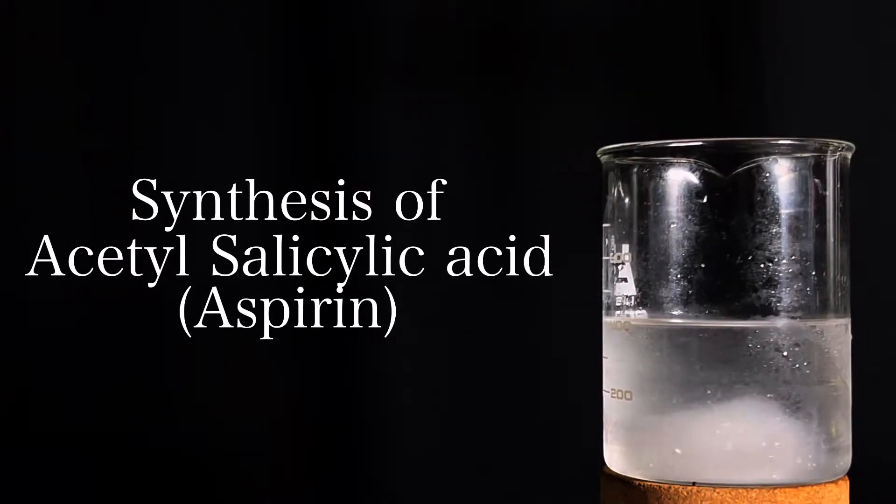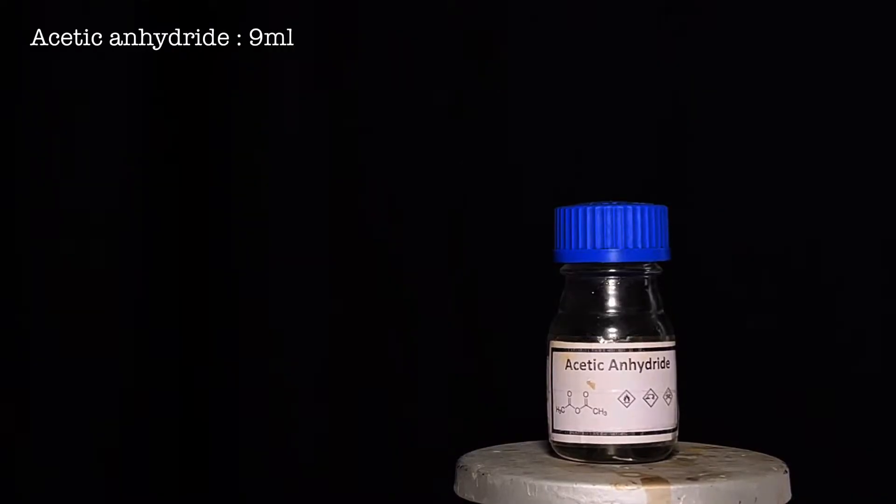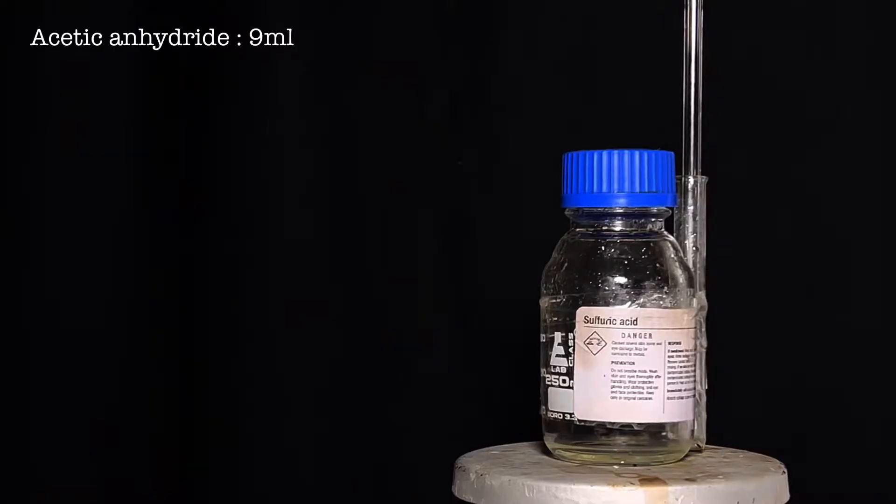Hello friends, in this video we will be synthesizing aspirin, or acetyl salicylic acid, by the acetylation of salicylic acid. For this synthesis you will need 5 grams of salicylic acid, 9 milliliters of acetic anhydride, and 5 drops of concentrated 98% sulfuric acid.